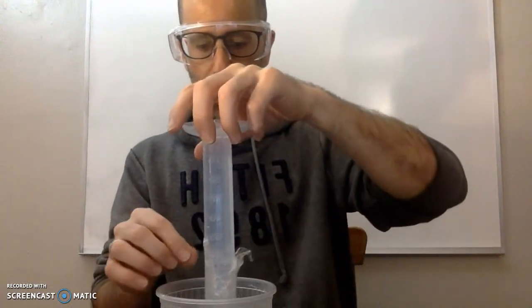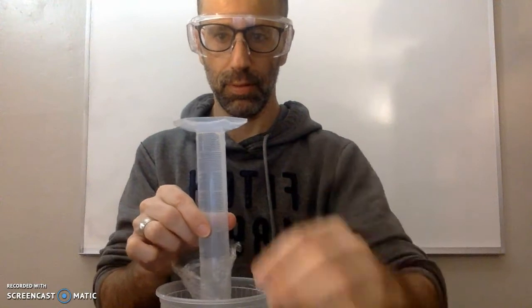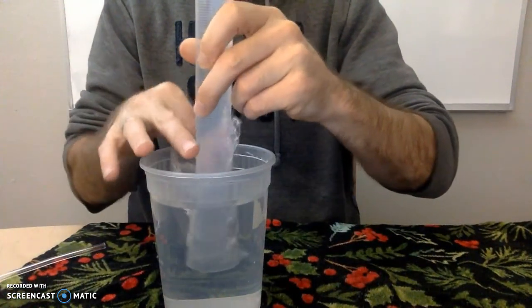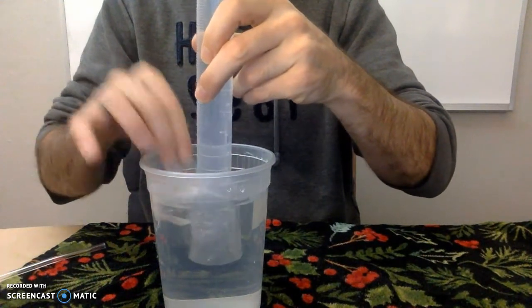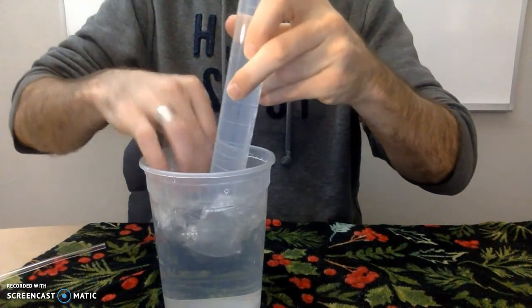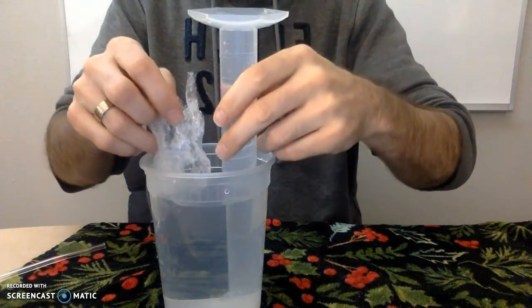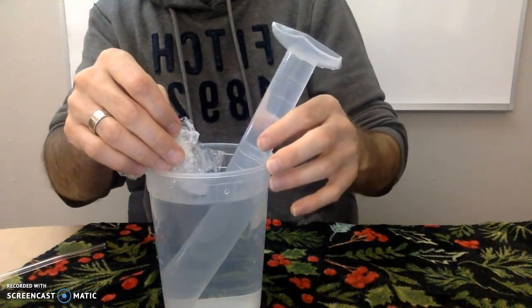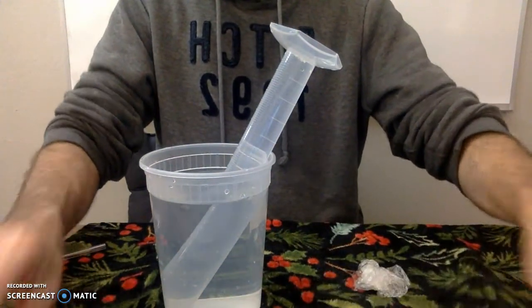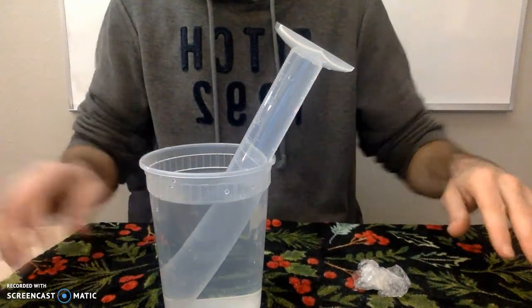I'll turn it over and stick it inside — now I can take off the plastic wrap. Just make sure you don't lift the end of the graduated cylinder out of the water, otherwise air from the atmosphere will get in and you'll lose your water. Very little air got in. I have a towel on the table in case I spill so I don't make a mess.